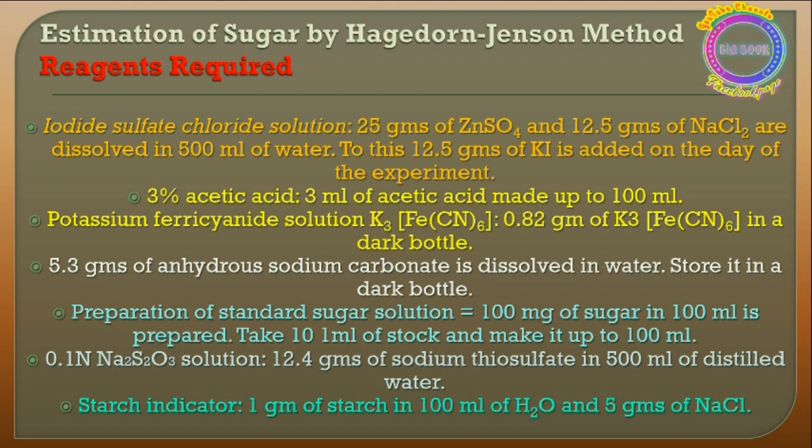So here, from the standard sugar solution which we have prepared in 100 ml with 100 milligrams of sugar, we are going to take 10 ml and make it up to 100 ml. So that 10 ml is going to be the standard stock solution for the experiment. Further is 0.1 N sodium thiosulfate solution, 0.1 normality.